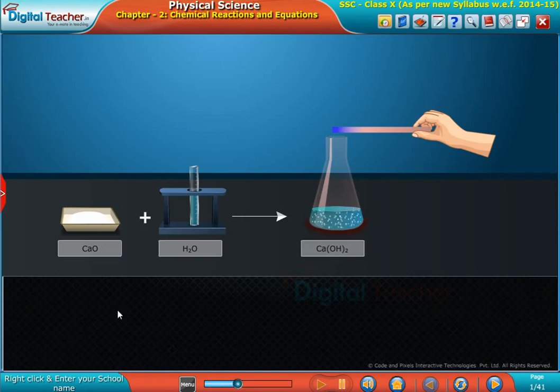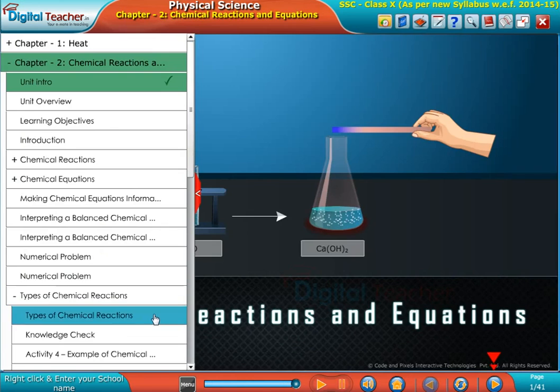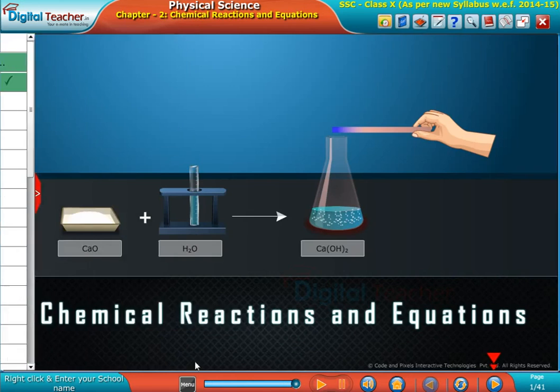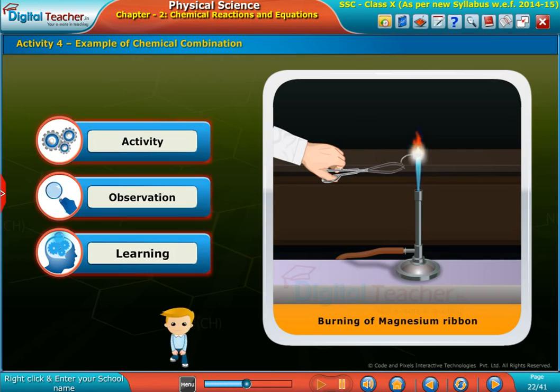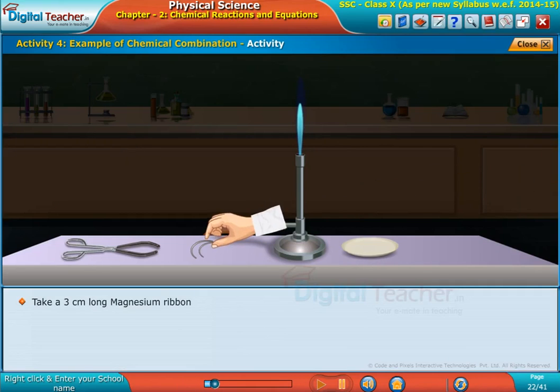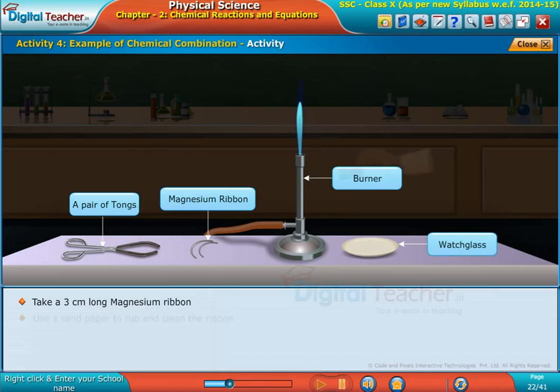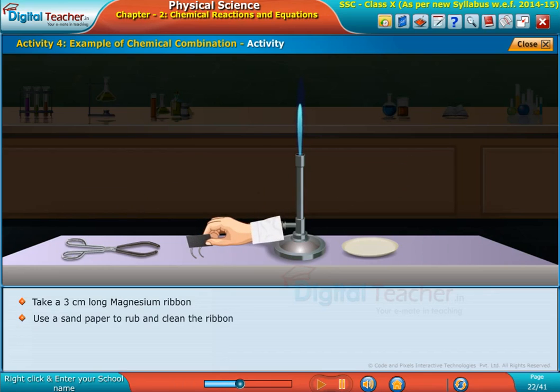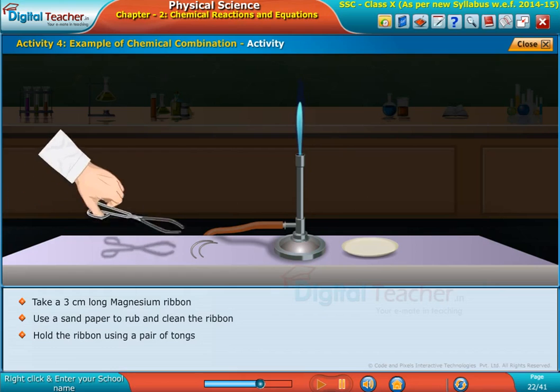Welcome to the chapter on chemical reactions and equations. Example of chemical combination: take a three centimeter long magnesium ribbon, use sandpaper to rub and clean the ribbon, and hold the ribbon using a pair of tongs.